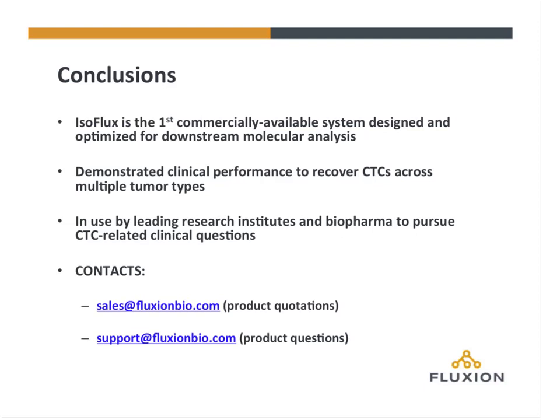So purity is a metric that's not often tracked. We routinely measure purity on every sample because we feel it's important to know what the purity of the sample is before moving to the downstream assay. And we've characterized several different assays, including some that I've mentioned here, mutational profiling, sequencing, gene expression, are all very adequate and work just fine at that level of purity.